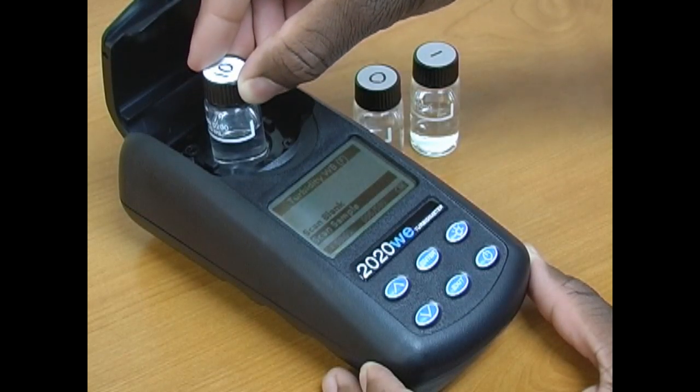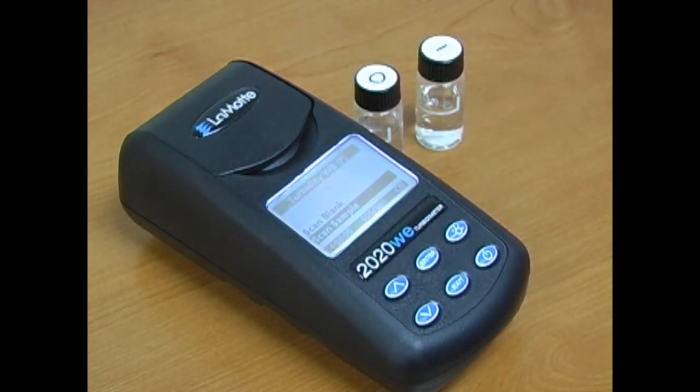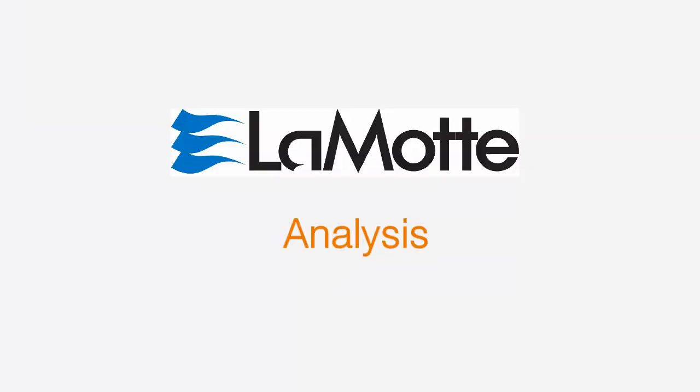Use the up and down arrow buttons to adjust the calibration to 1 and press enter to store. To calibrate the meter across a larger range, follow the same procedure for the 0 and then use the 10 NTU standard to calibrate. Your meter is now calibrated and ready to use.